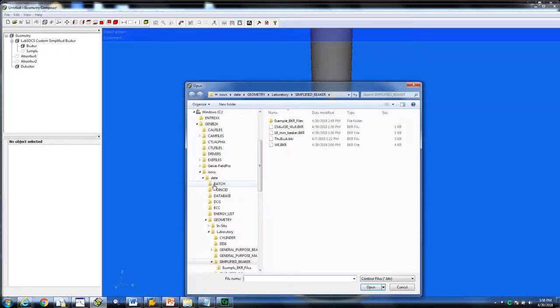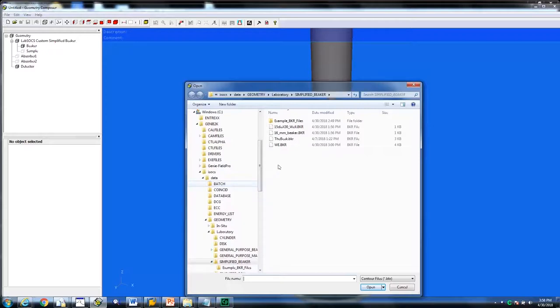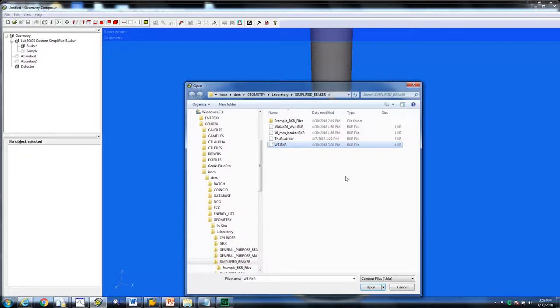The third step following any custom beaker is to load a particular BKR file. The BKR file allows a custom container that we can fill with activity. Select the BKR file, then click Open.